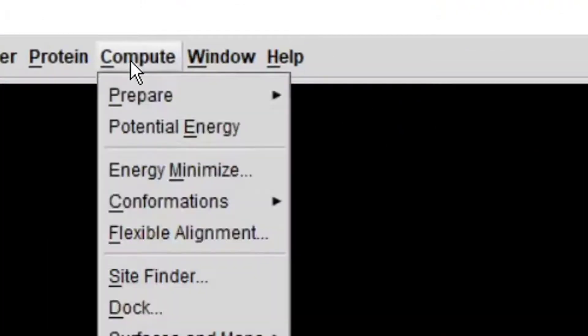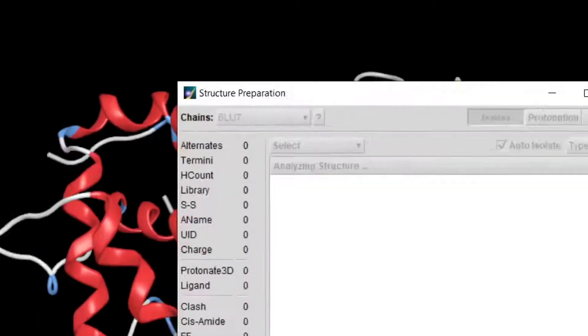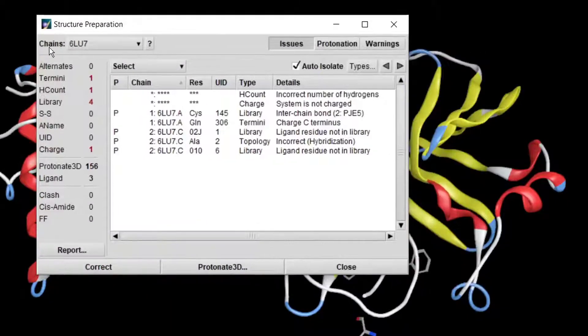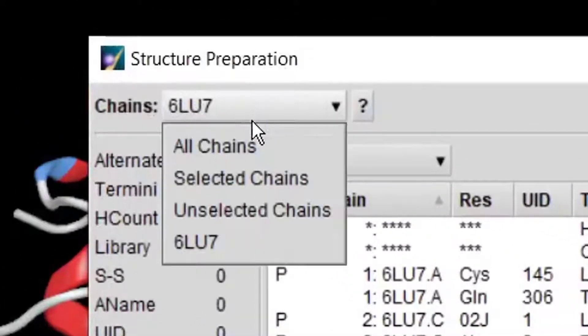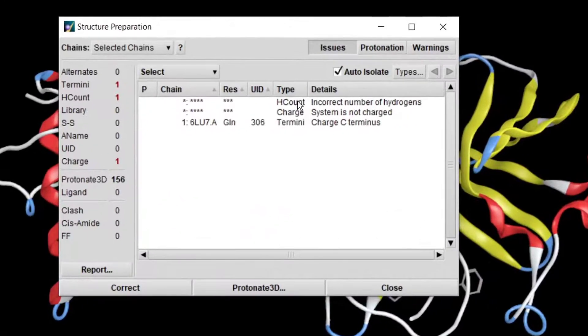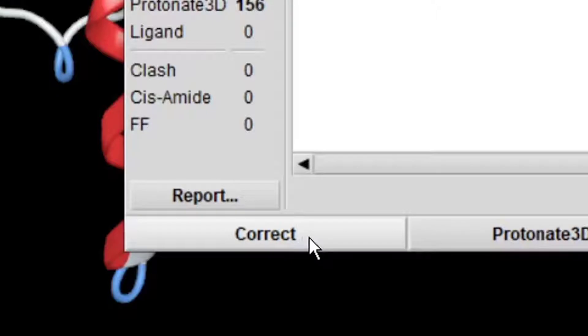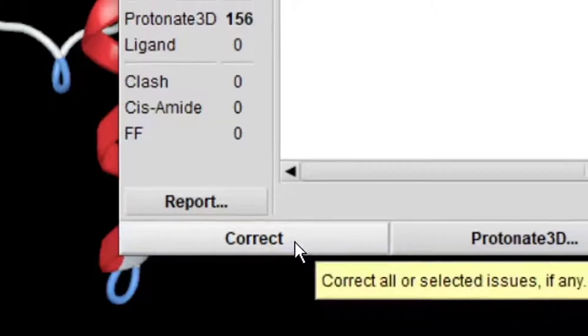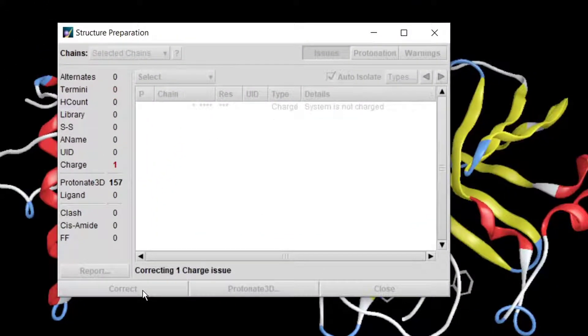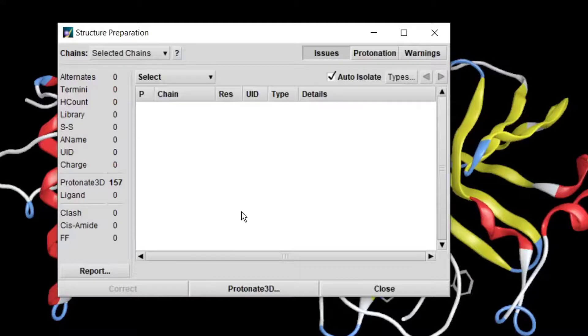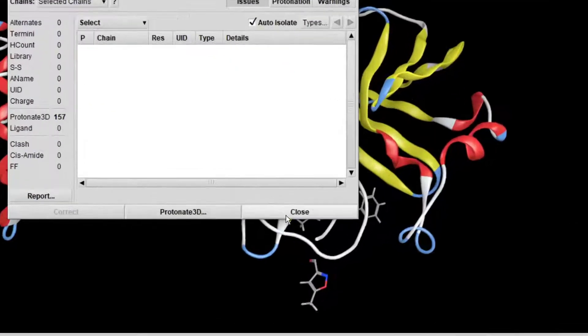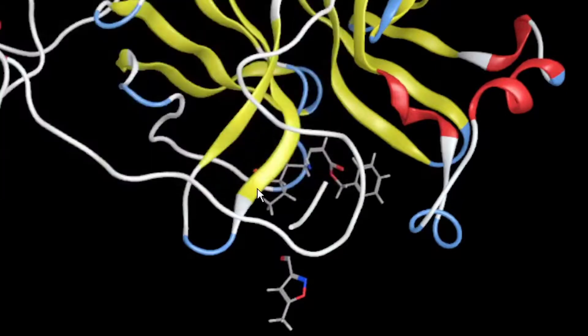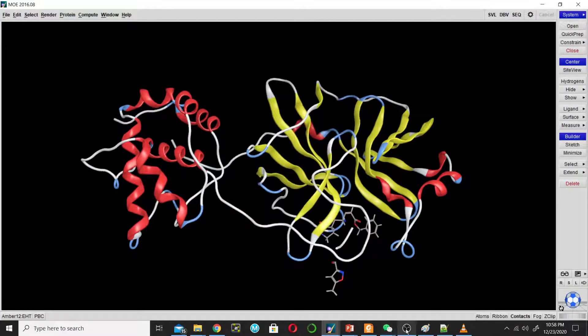Then go to compute, prepare, and structure preparation. Here change it to selected chain. This chain has three issues. Click on correct to solve all issues. Now the structure is free of any issues. Click close. Now we will minimize the structure.